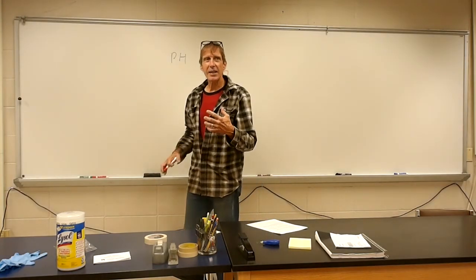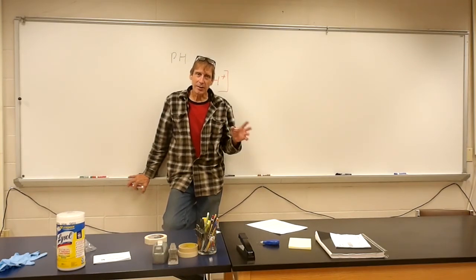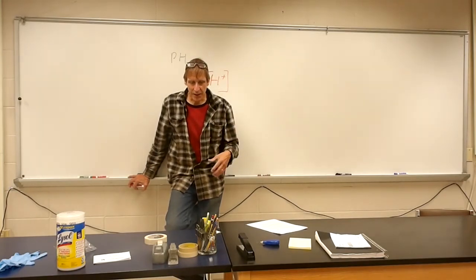pH is important because it impacts how other chemical reactions will occur. We mentioned it a little bit with the freshwater ecology lab. The pH of the water can have an impact on how toxic other chemicals in the water can be. pH also affects the characteristics of enzymes and other proteins, and limits how well they'll work in a given environment.